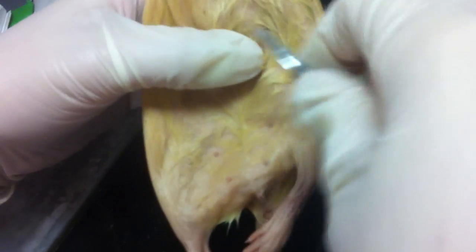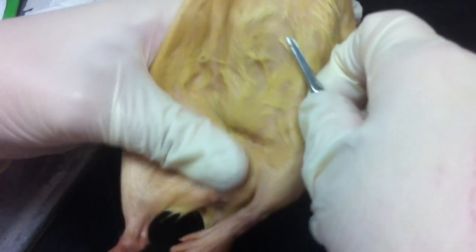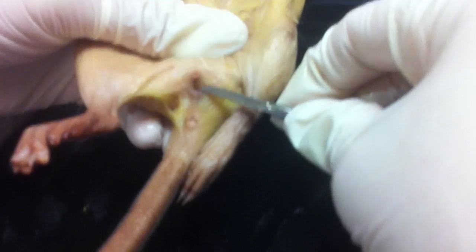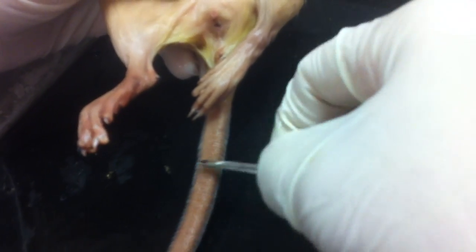We have a female, so these are the mammillary papilla. And if we look down here, this is her clitoris, that's her vulva, and here's her anus. And then on the tail, these little scales are called horny scales.